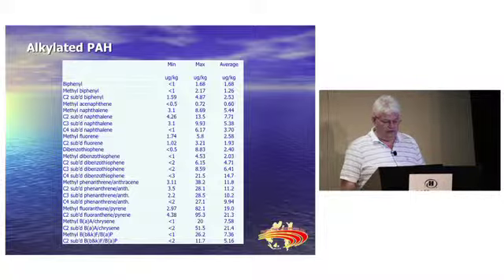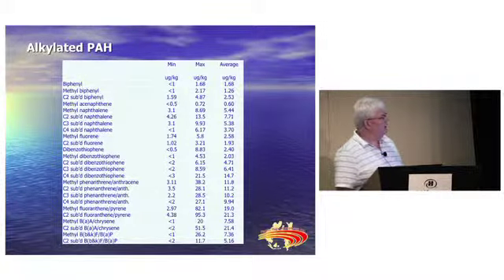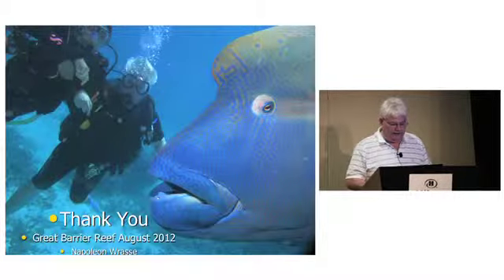But this method is a viable option for looking at PAH and alkylated PAH in tissue. And with that, I thank you.